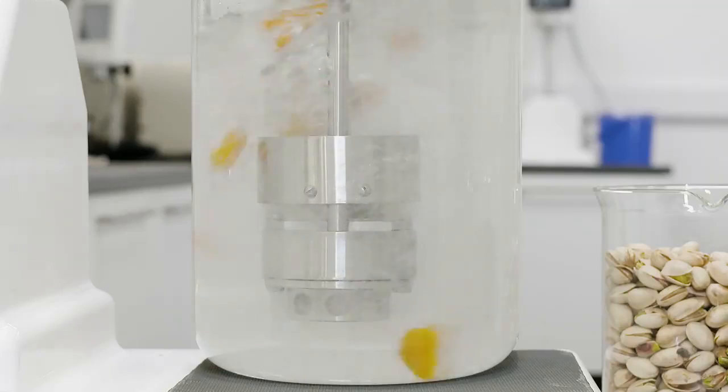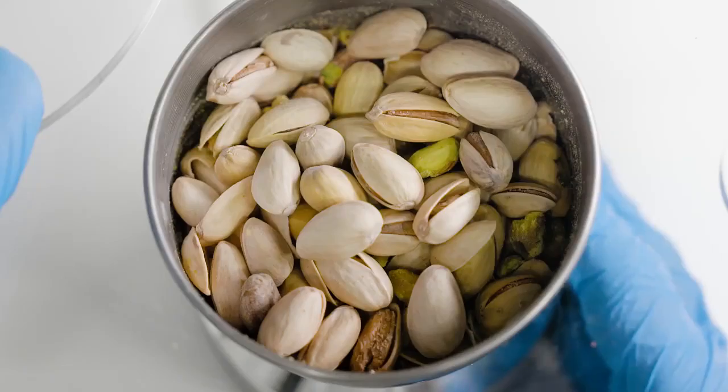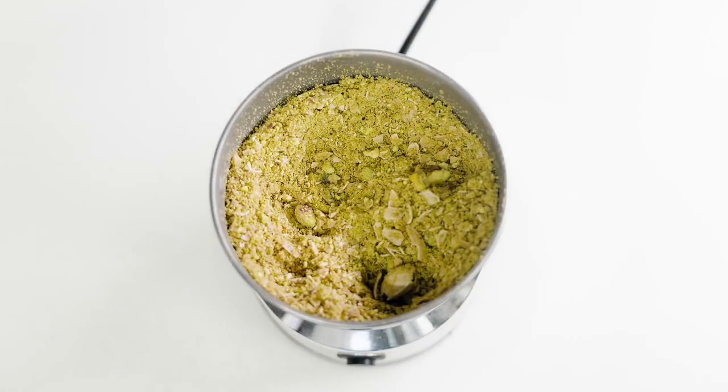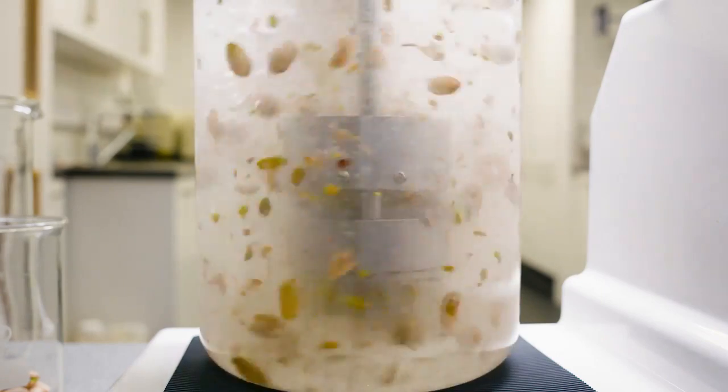Research has identified that preparation of samples by slurrying offers significant advantages over dry milling. For example, the heat generated by dry milling can degrade the aflatoxin, distorting results. This problem is eliminated by slurrying the sample in water.